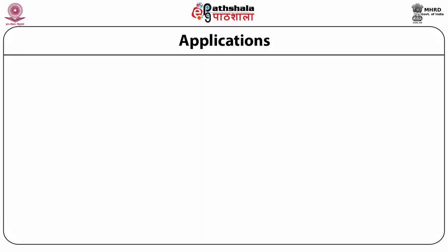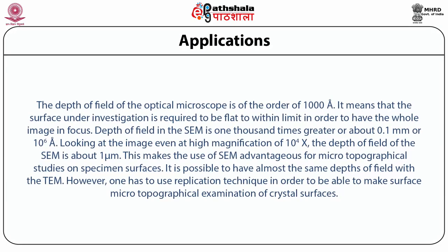Let us talk about the applications. The depth of field of the optical microscope is of the order of 1000 angstroms. It means that the surface under investigation is required to be flat to within a limit in order to have the whole image in focus. Depth of field in the SEM is 1000 times greater, or about 0.1 mm, or 10^6 angstroms.